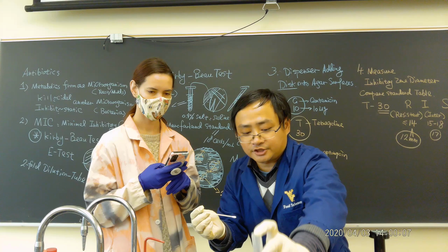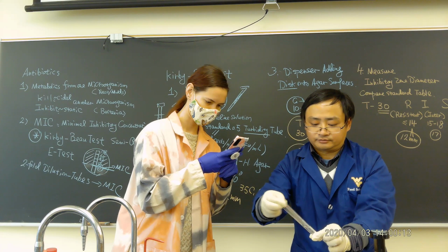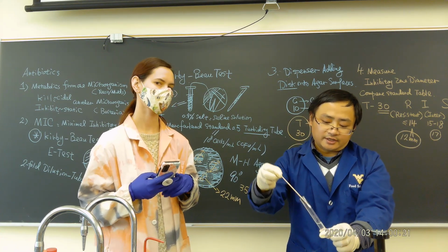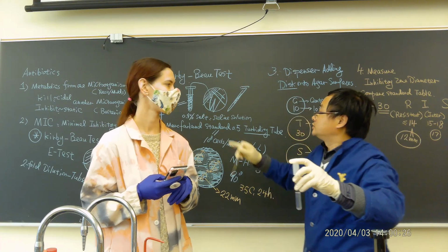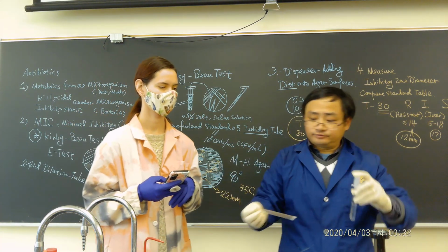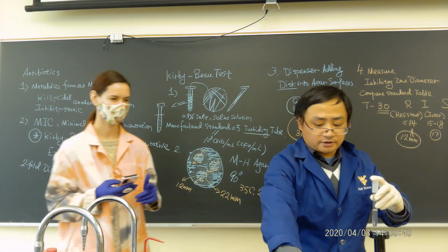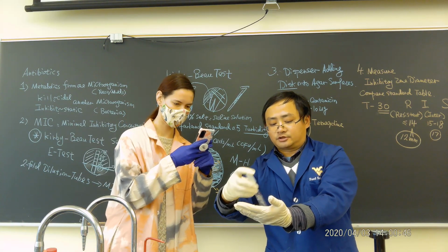Now we put it into a saline solution. This is a saline solution. So let's say we added it. Okay, you can take a picture. I don't know how dense it is, but ideally the amount you put should follow the McFarland standard, which means I should compare with a standard. I don't have it right now. Okay, so this one actually should be thrown away. I will just put it on this side. Okay. Now I want you guys to make sure it's mixed very well.